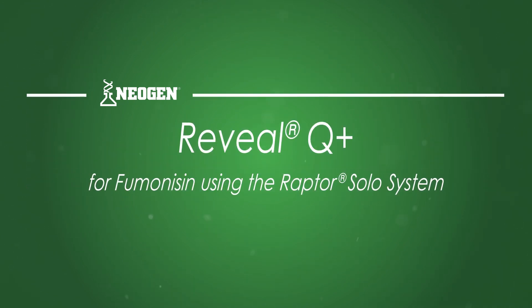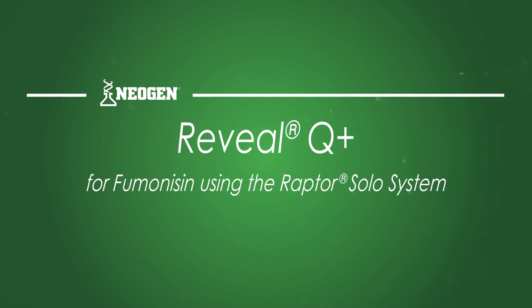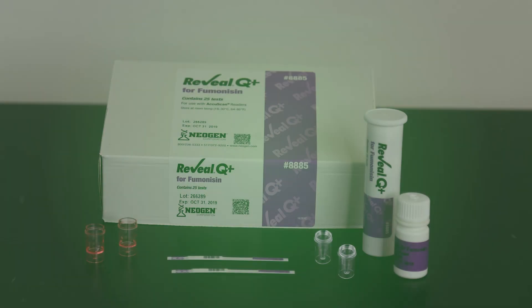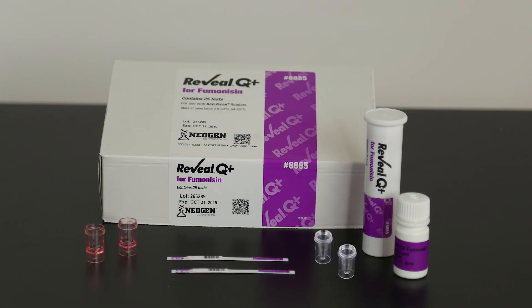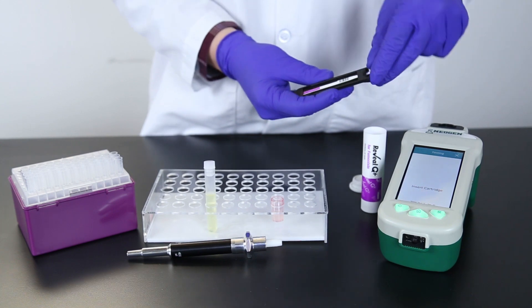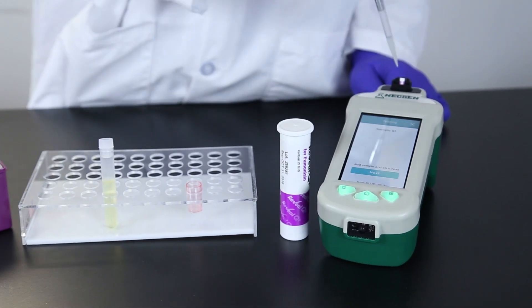In this video, we'll look at everything you need to know to run Reveal Q Plus for Fumonisin using the Raptor Solo system. The Raptor system allows you to add sample and walk away. It's that simple.